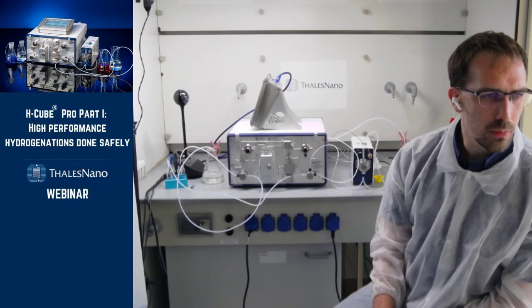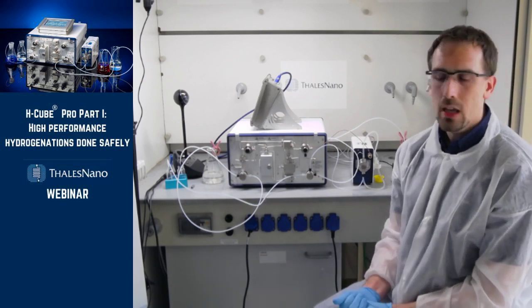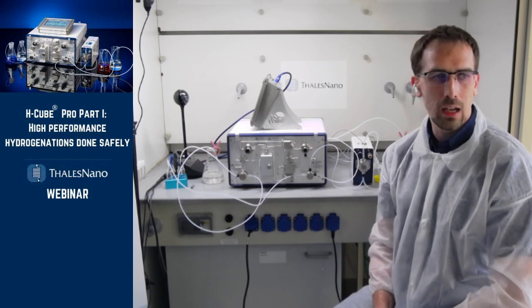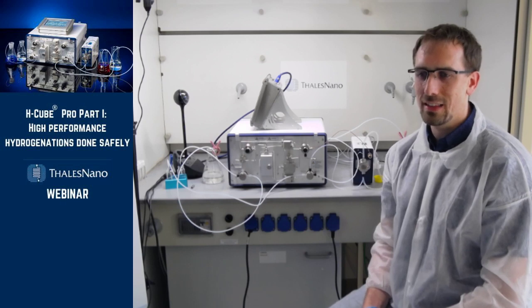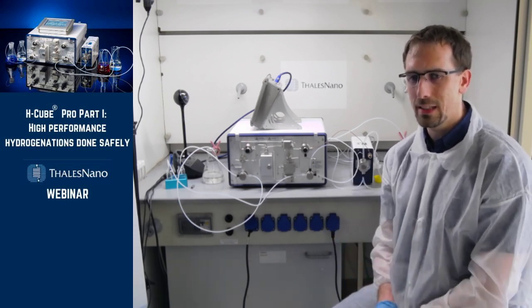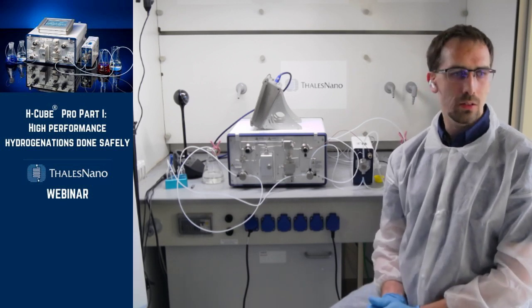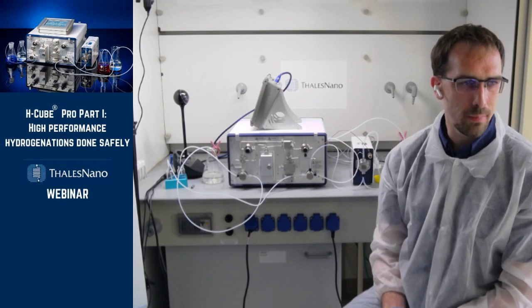If one electrode goes bad, can the instrument generate hydrogen? In the Pro, we have two electrocatalytic cells. I'm not aware of examples when one of them went bad. I would need to check this with our service engineers. So please allow us to answer this question in email later on.